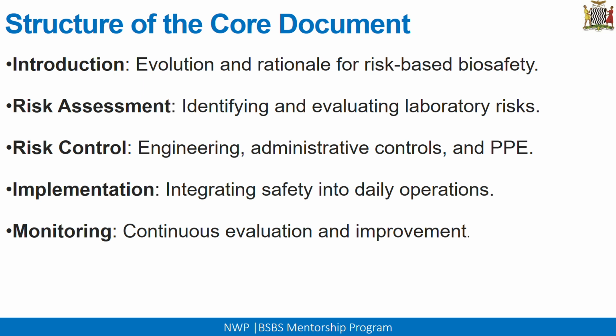Then it also looks at implementation, so integrating safety into daily operations, of course implementing depending on the risks that are determined for each particular laboratory. Then it also emphasizes the monitoring of the implementation of the control measures, because if you are monitoring, this will ensure that there's continuous evaluation and improvement of your overall management system.